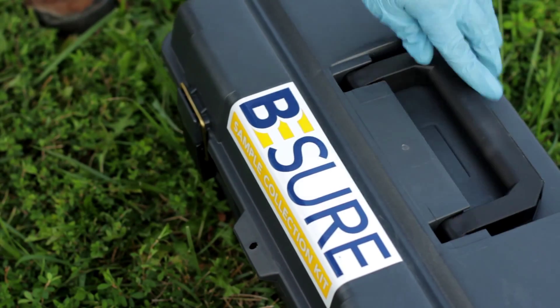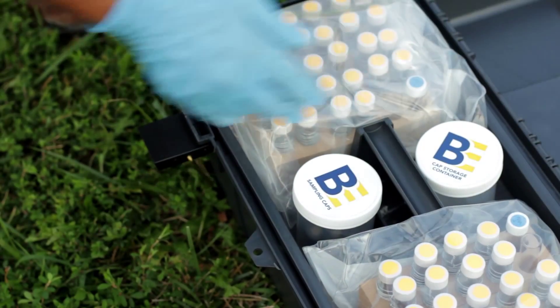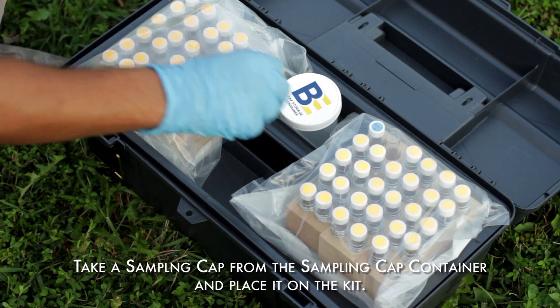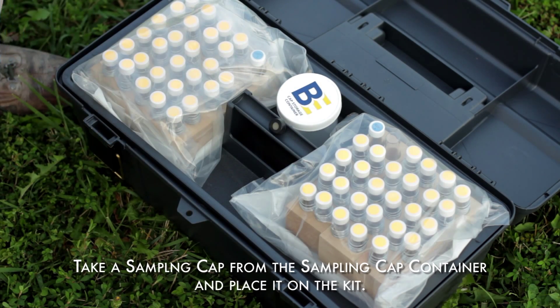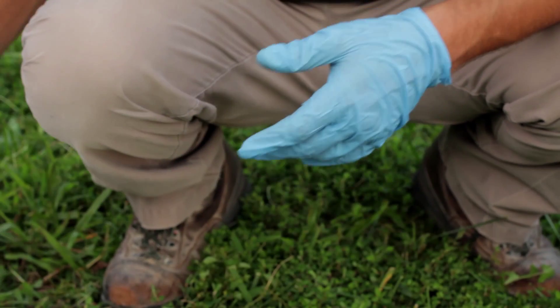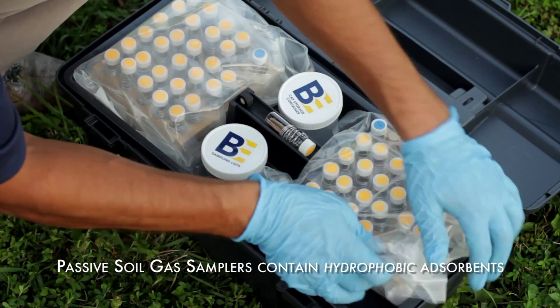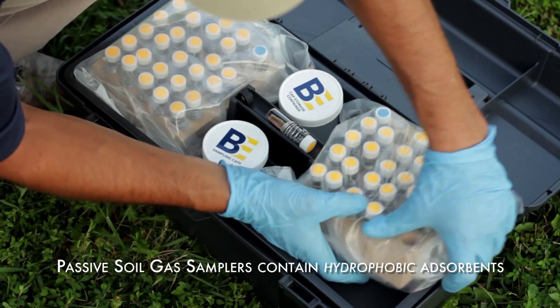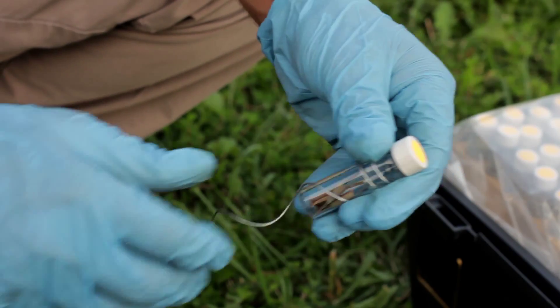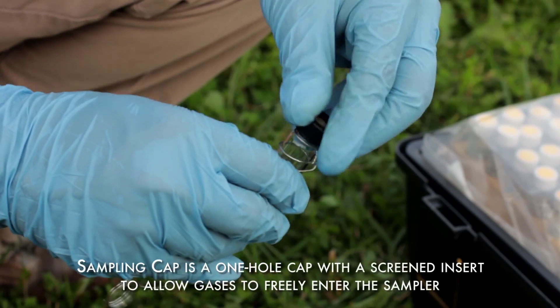Place the kit next to the sampling hole and open the kit. While wearing nitrile gloves, take a sampling cap from the sampling cap container and place the cap on the kit. Next, take an approximately twelve inch length of aluminum foil from the box and place it next to the sampling hole — this will be used to plug the hole. Remove one of the passive soil gas samplers, a glass vial containing hydrophobic adsorbent cartridges. Remove the solid shipping cap on the sampler vial and replace it with the sampling cap.